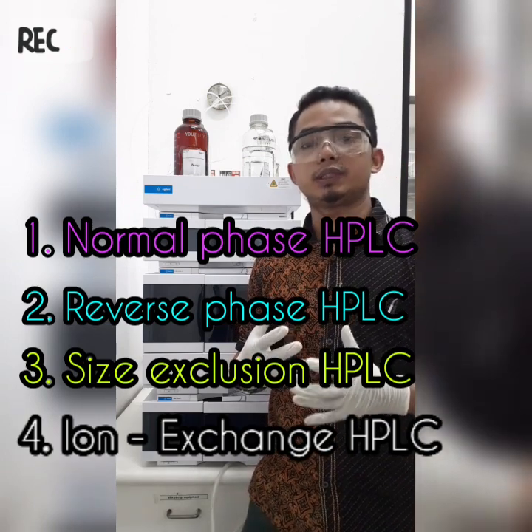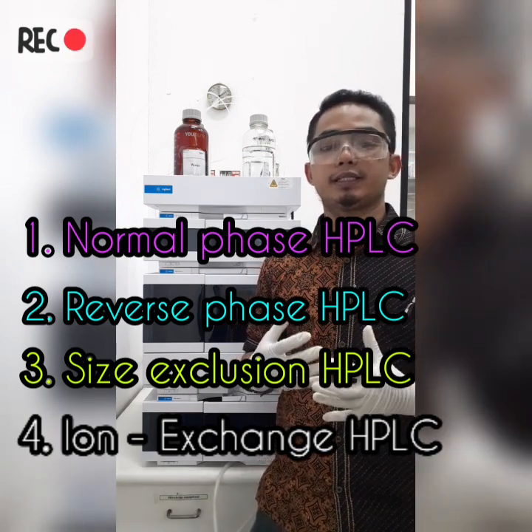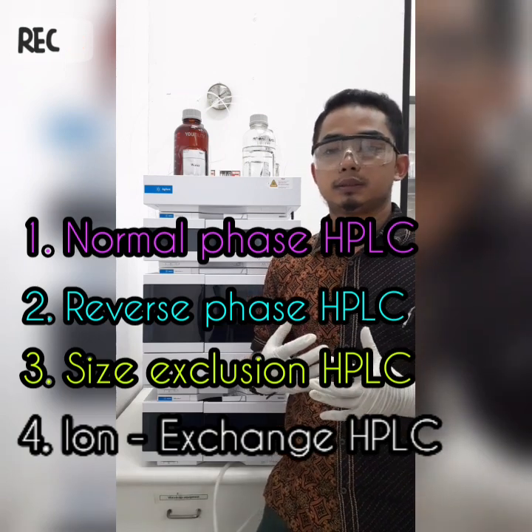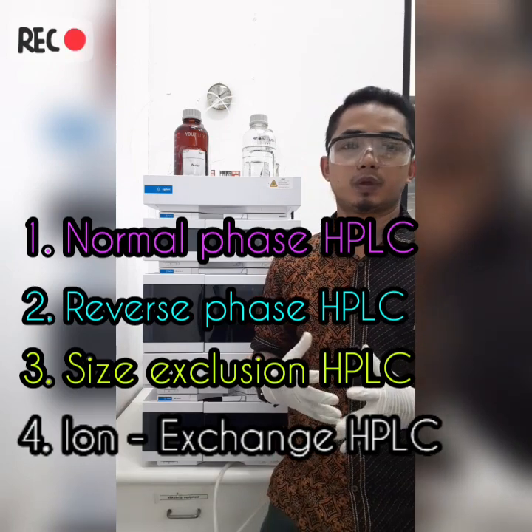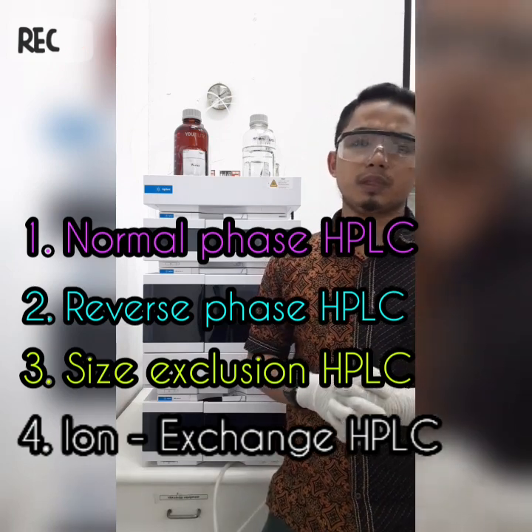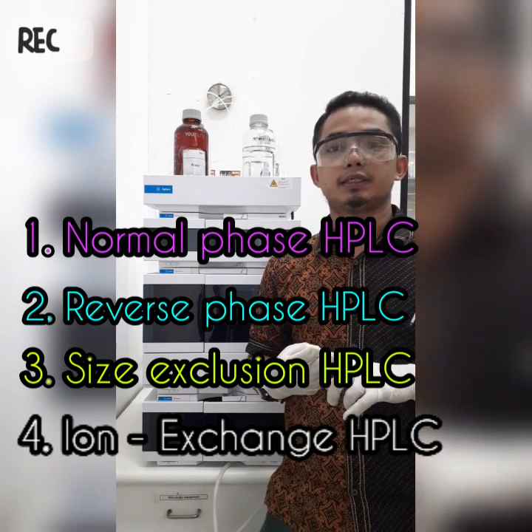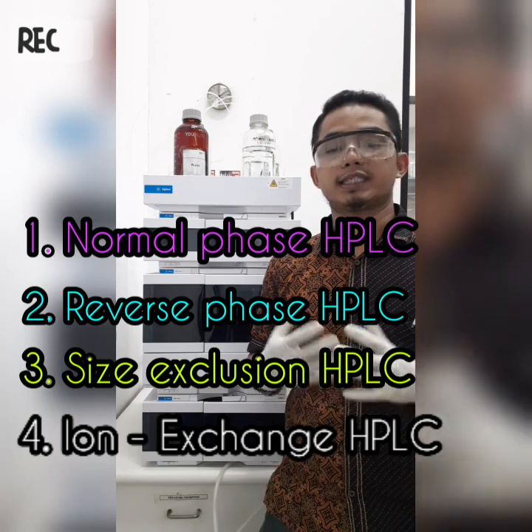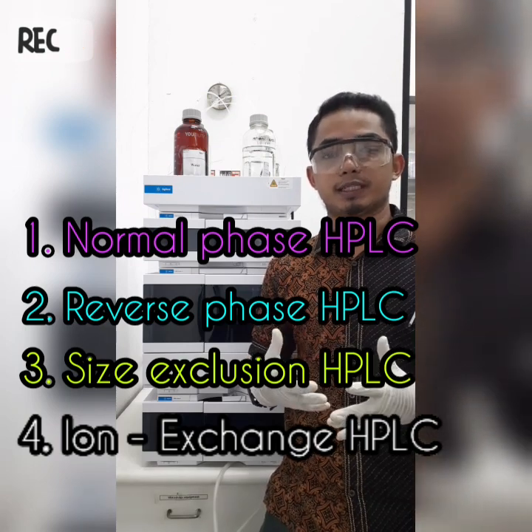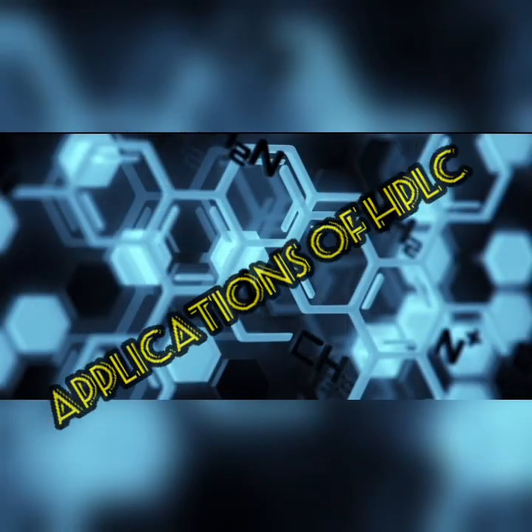It works on the principle of hydrophobic interaction, hence the more non-polar the material is, the longer it will be retained. Okay, so I will explain two variants, and the next time I will explain the size exclusion HPLC and ion exchange HPLC.